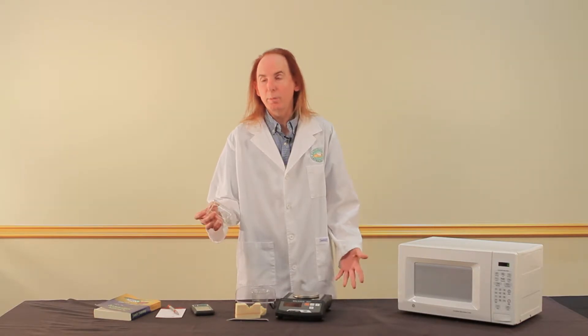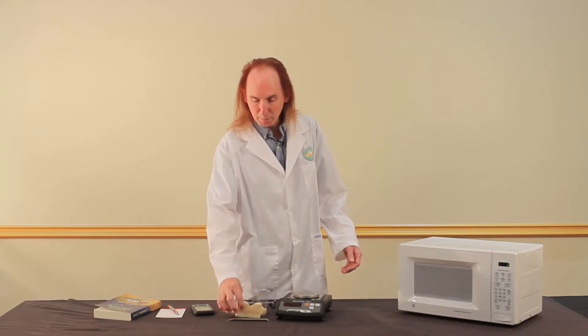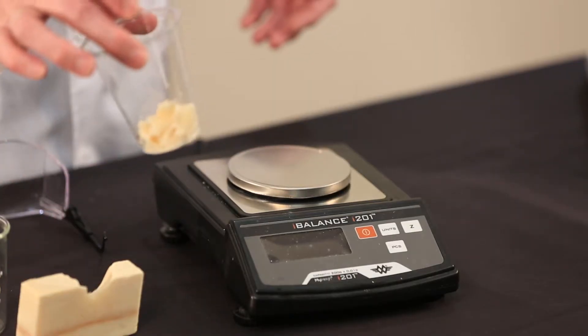We also need a beaker. A Pyrex measuring cup will do, but beakers are pretty cheap and very convenient. We also need a piece of soap to test, something that we can shave soap with, and something to put the shaved soap into.